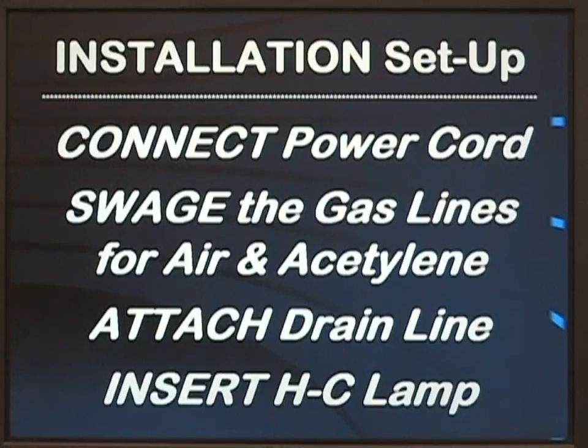To continue with the installation setup, you will have to connect the electrical power cord for the instrument, create a gas-tight swage lock fitting for the gas lines for the air and acetylene and nitrous oxide if used, attach the Tygon drain line with a loop to prevent flashbacks, and insert the hollow cathode lamp for the element you are going to use for your first analysis.